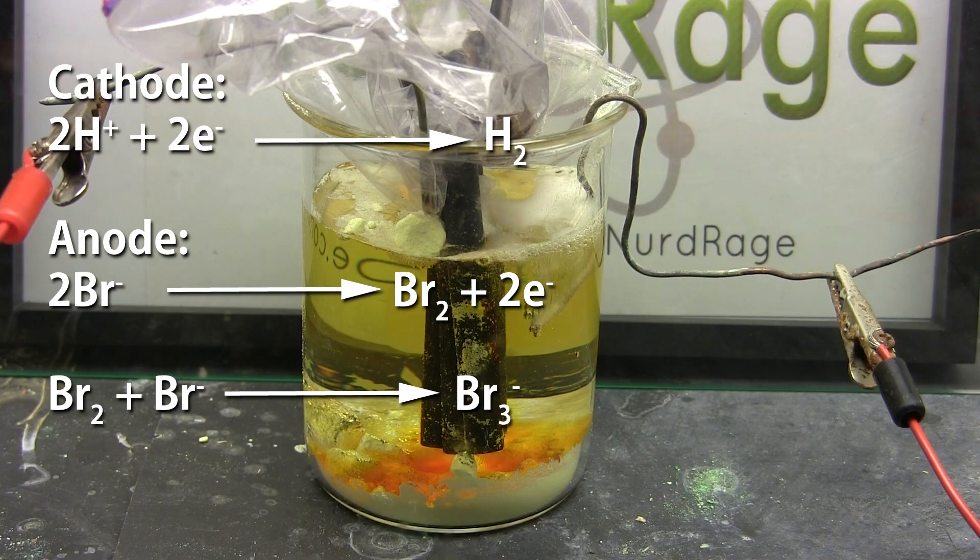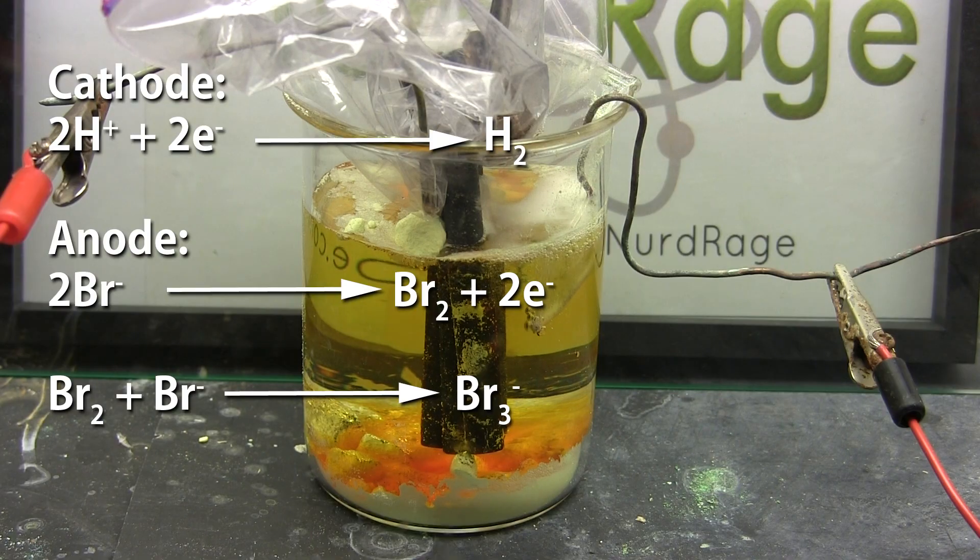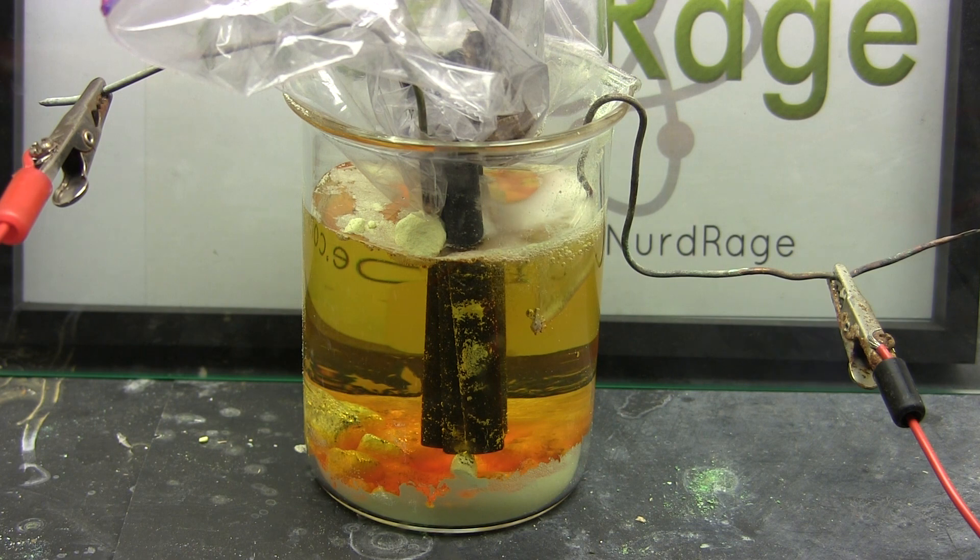Early on in the electrolysis this doesn't do much as the bromine quickly reacts with additional bromide to form tribromide ions which don't react with sulfur. You can see it here as this orange solution that sinks.